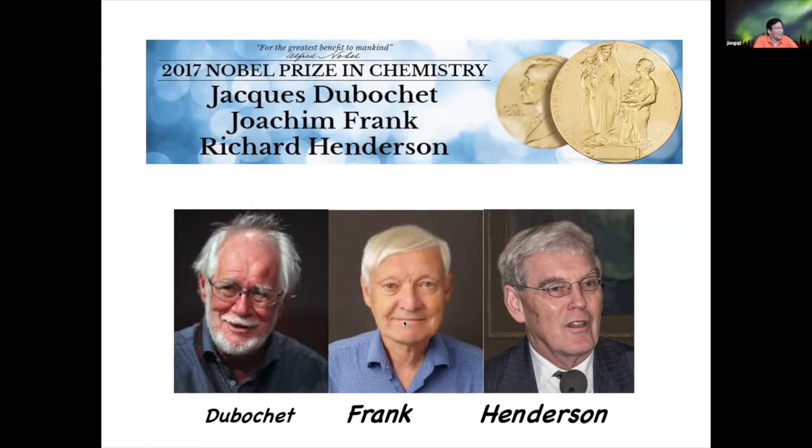Here are the images of the three pioneers: Jacques Dubochet, Joachim Frank, and Richard Henderson. Dubochet developed the first method for flash freezing of the cryo-EM specimens, which is very important for preserving atomic resolution information of biological specimens.